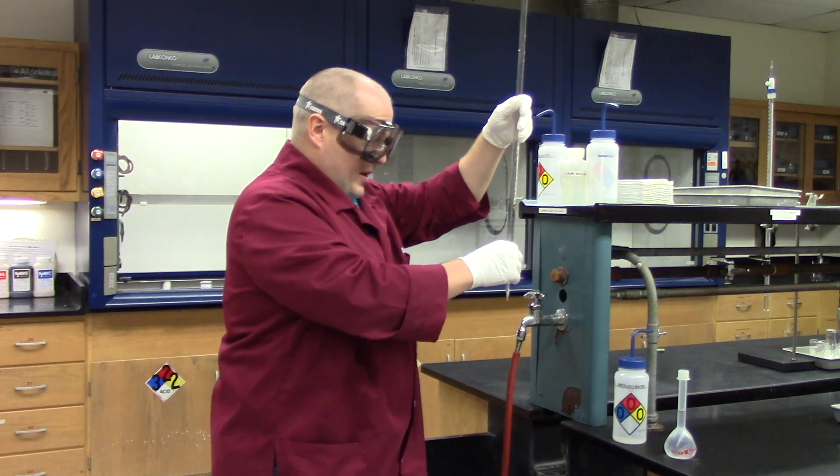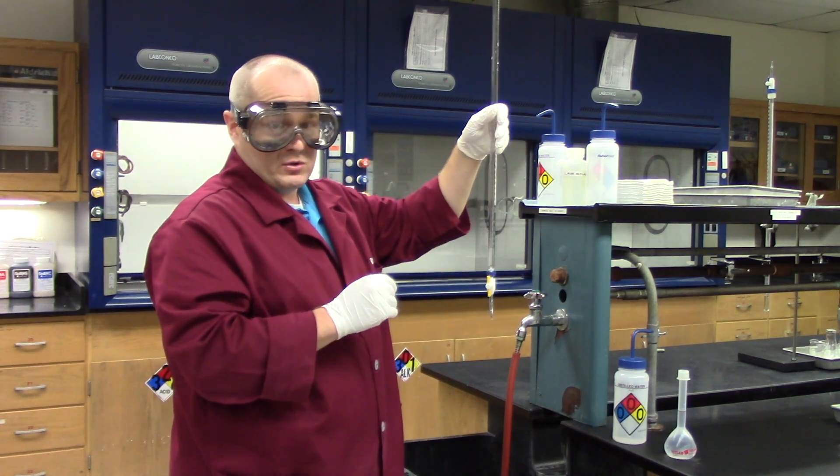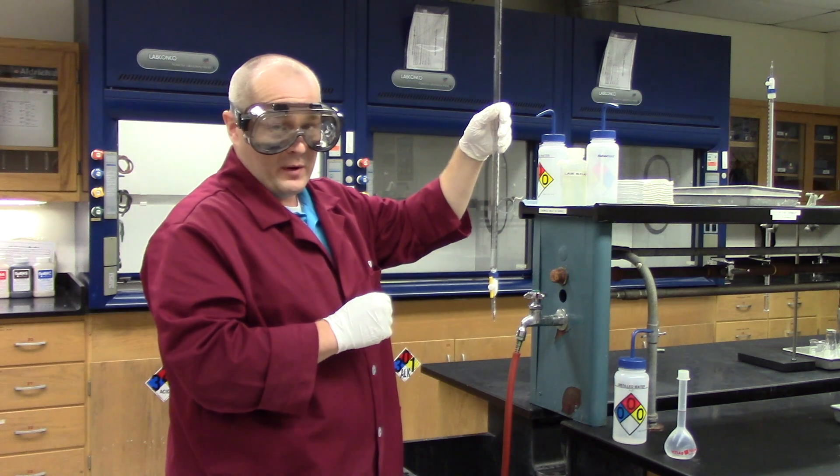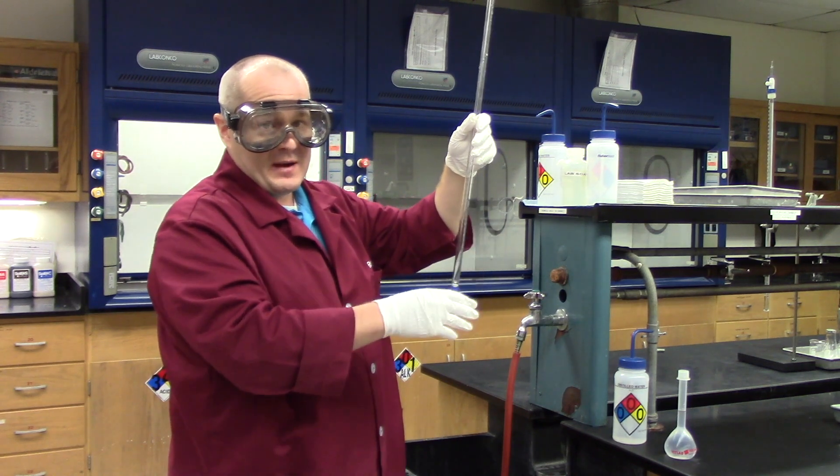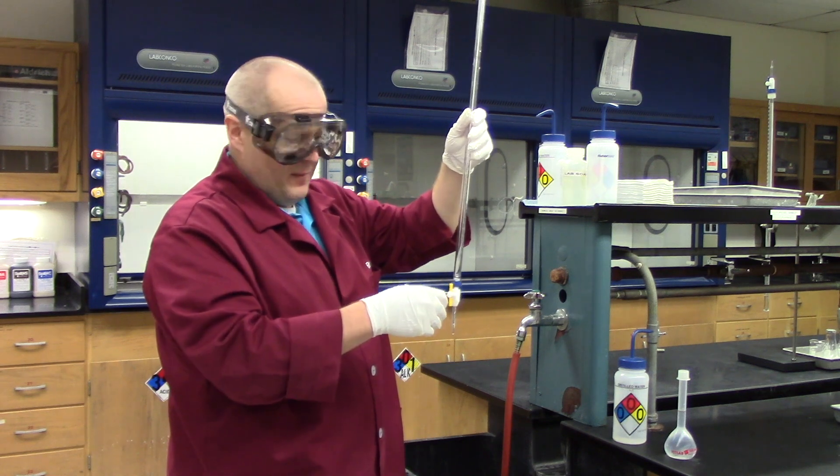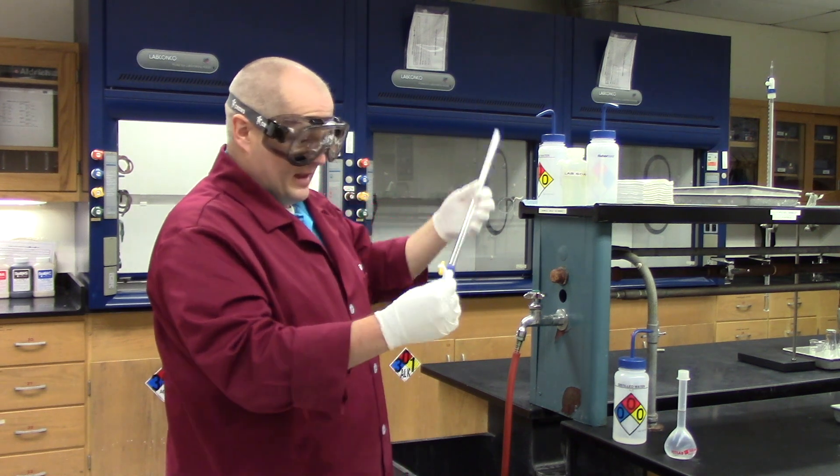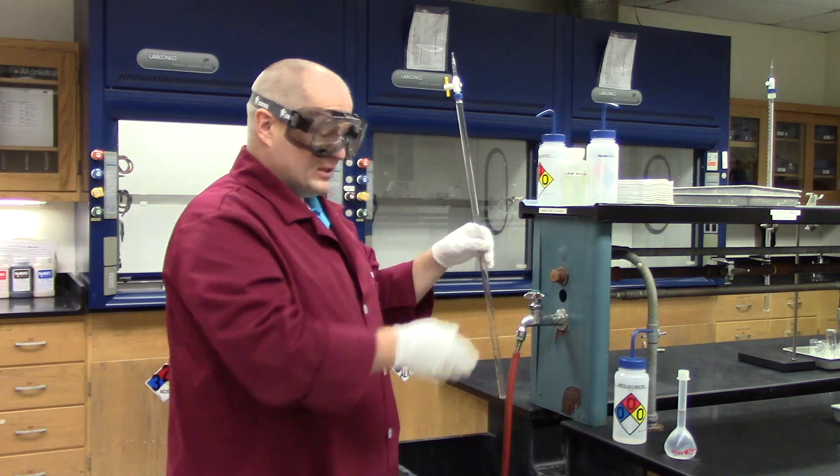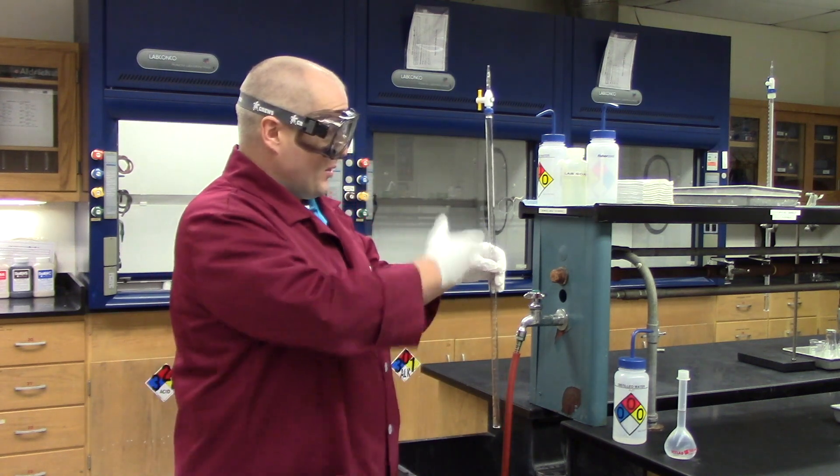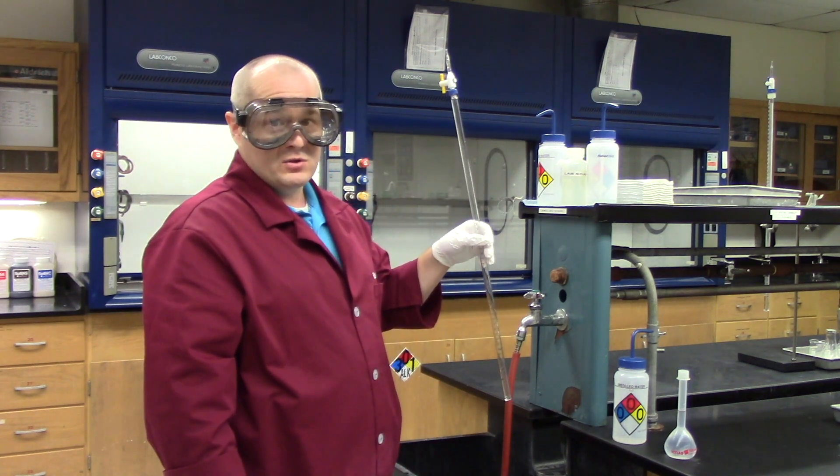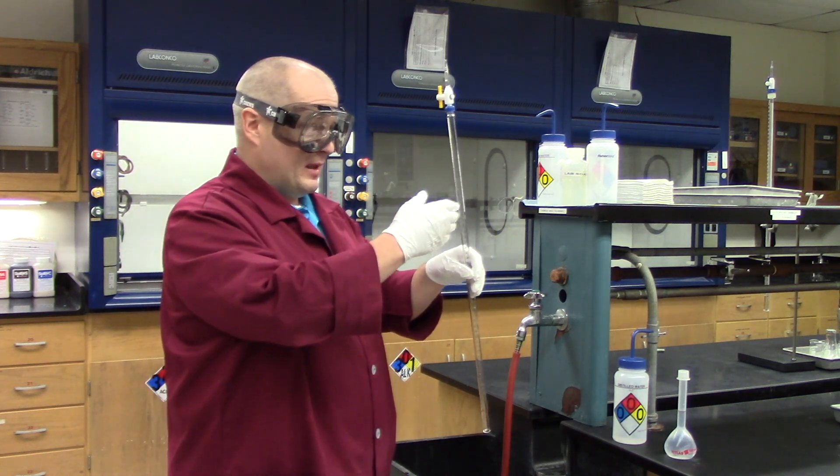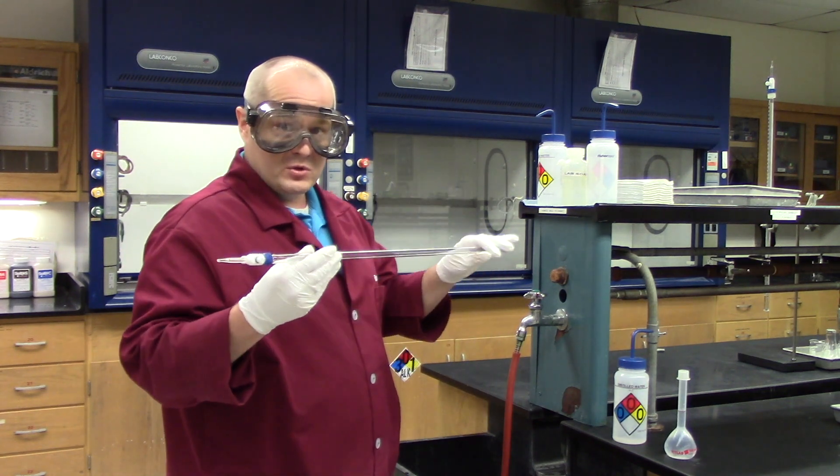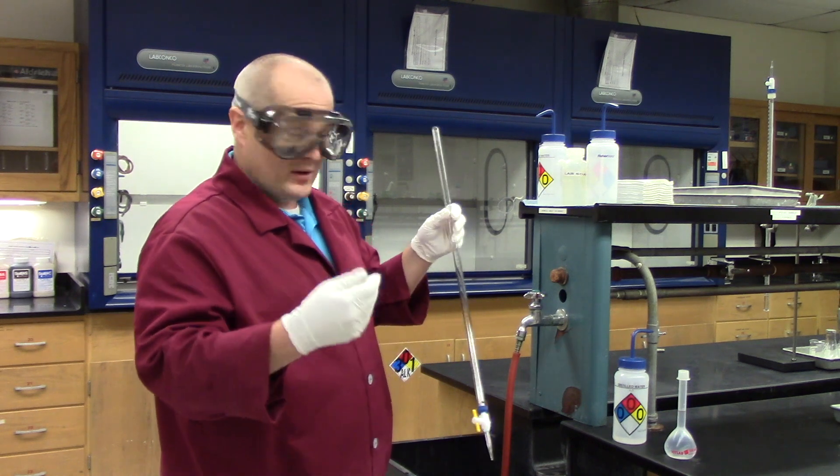Now, the solution that we want to put in the burette is a water solution. It is your antacid dissolved in water. But we don't want this water in here. We don't want to spend all day waiting for it to dry, so what we can do is take a little bit of the antacid solution that we've created and put it in here and rinse it with the antacid solution a few times. It doesn't take more than a few mLs, and it will get the burette coated with the solution we want to use, so we can just go ahead and use it.